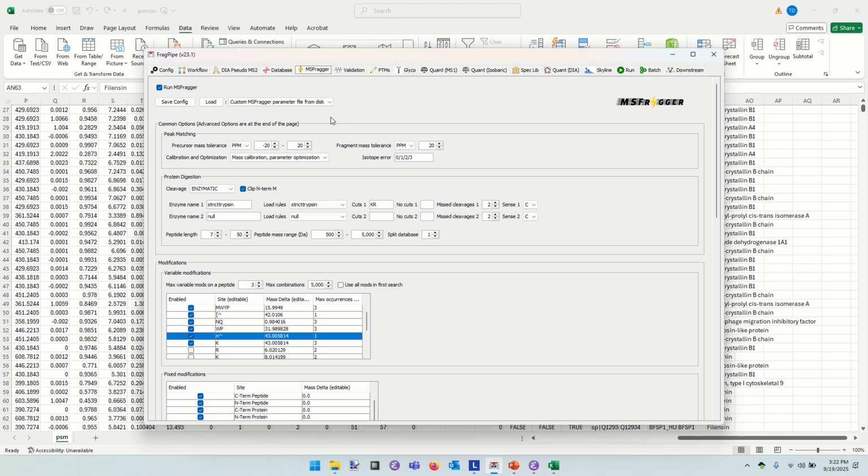And that glycan structure breaking away from the peptide is more labile than the peptide bonds. In that case, you get a big loss ion and no fragments. So I would say that's the bigger question. How does a modification of that magnitude alter the fragmentation of the peptide overall? If it stands in the way of the formation of B and Y ions, you're going to have a problem.